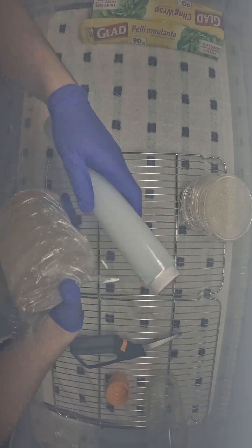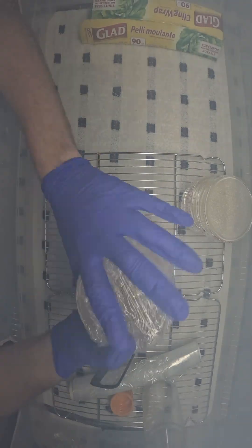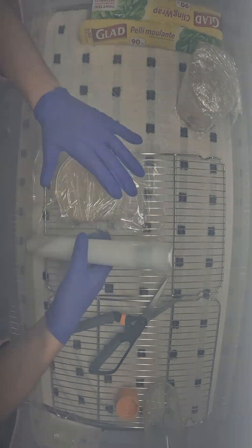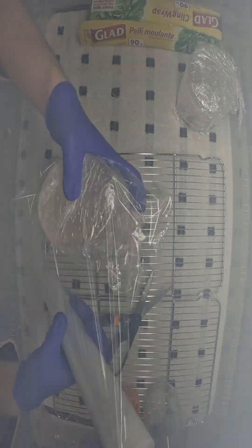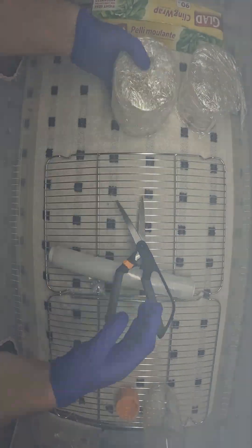Once they've cooled and set, you're going to wrap them in plastic wrap. I do a little bit too much here — it doesn't matter. I'm just making sure it's sealed thoroughly. These are going to stay here for 5 days so I can check if bacteria has contaminated them. If not, I'll use them for the growing of mycelium.